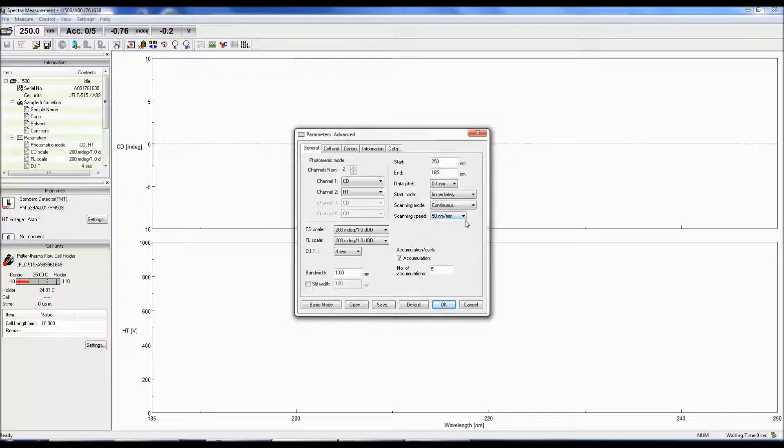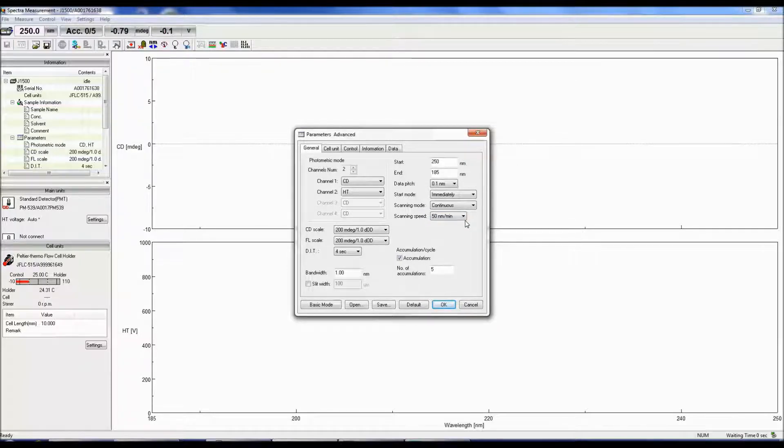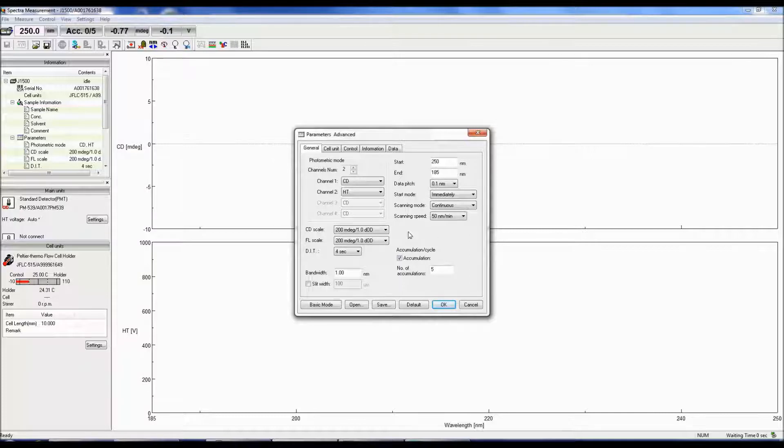The scanning speed is the speed at which the data is collected. 50 nanometers per minute is a good scan speed to begin with.